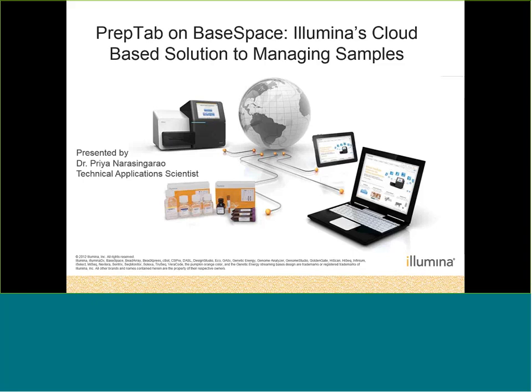I'm going to give you today an introduction on how to use PrepTab and how PrepTab will help you to manage samples on BaseSpace.